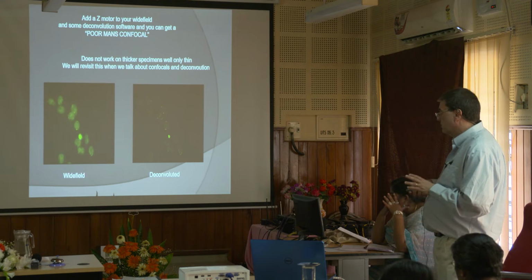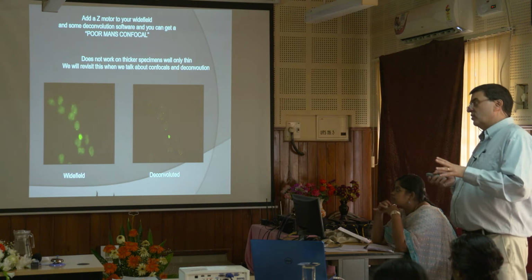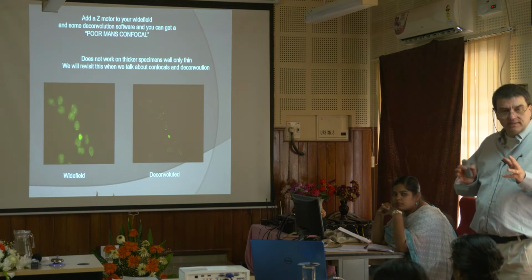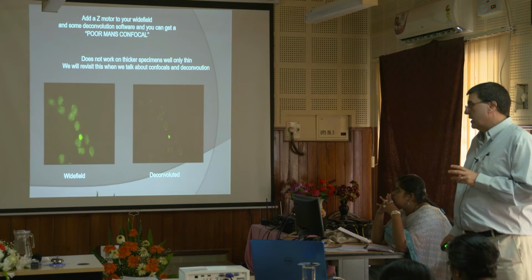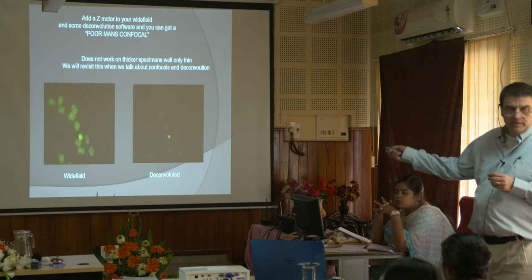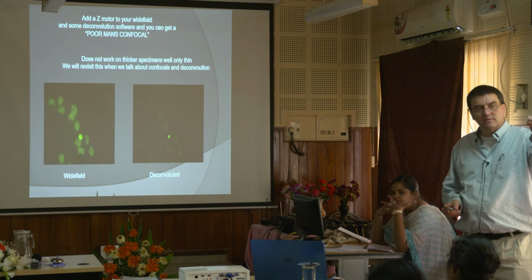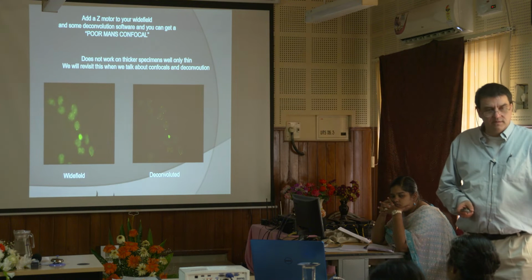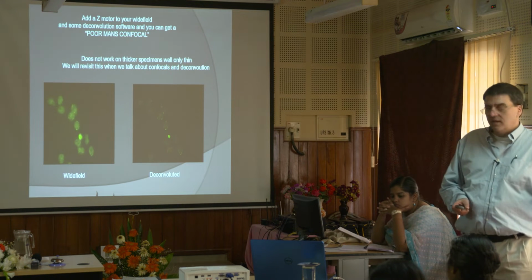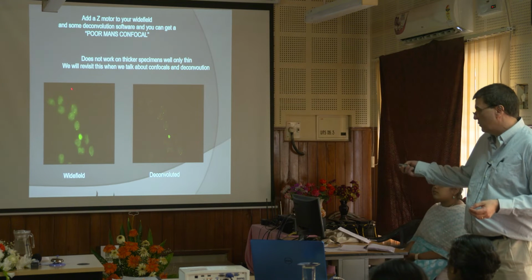Okay, so in general, deconvolution, again, is math. It's a massive algorithm. And what it says is, okay, we took these pictures, but nothing's perfect. No optical system is perfect. But what if it was perfect? If it was perfect, and we fed all these parameters in over here of what makes up this image.